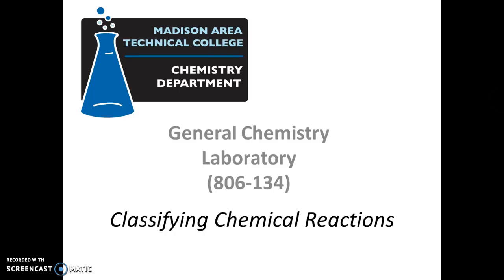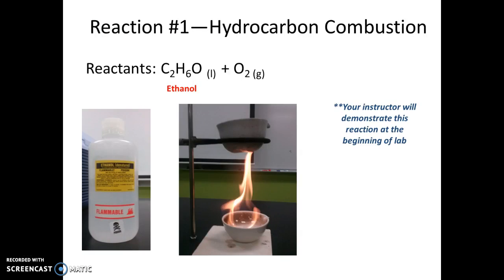This video discusses the procedure for the classifying chemical reactions experiment for general chemistry at Madison College. For this lab, you're going to be doing 8 different reactions, and the reactions are labeled 1 through 8. Something I want you to keep in mind as you watch this video is that for the post-lab questions, you're going to be asked to predict the products and write balanced chemical equations for many of these reactions. So keep that in mind as you watch the video and as you complete the reactions in lab.